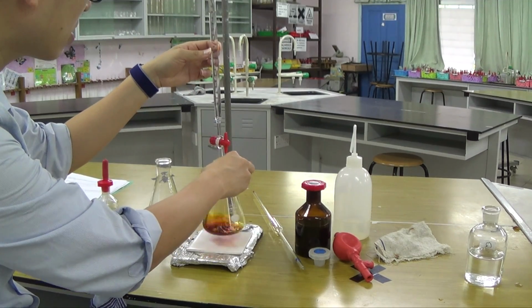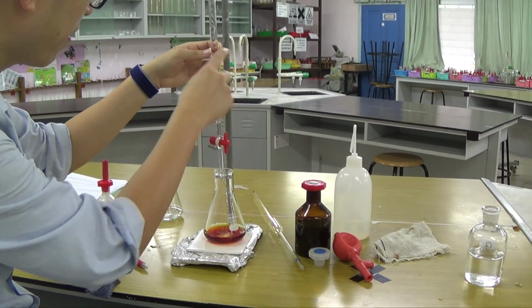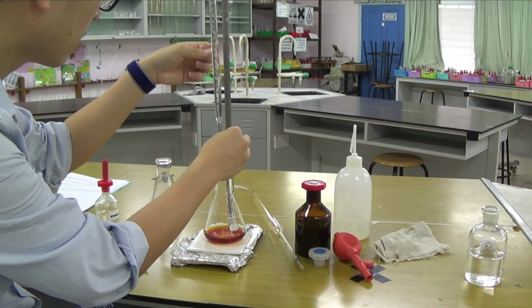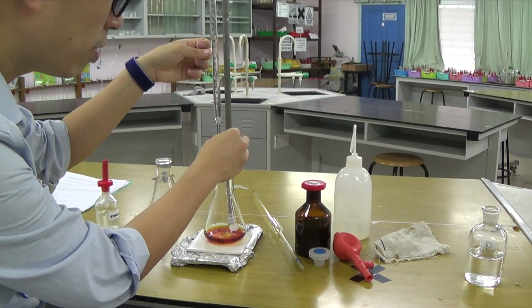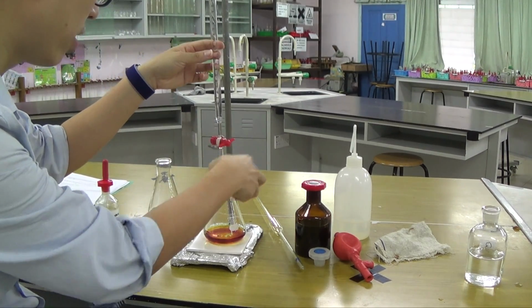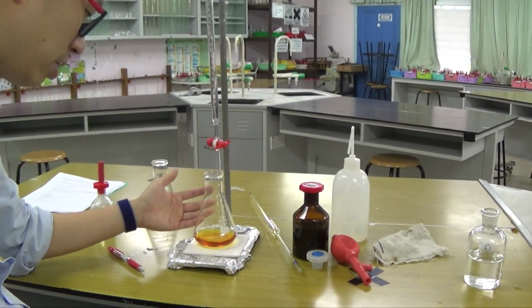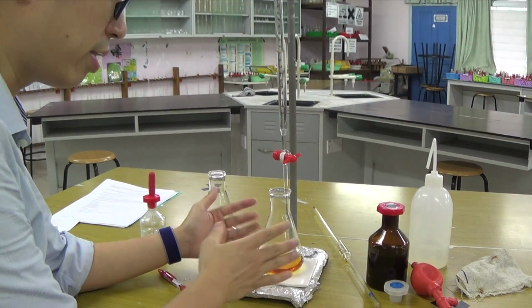Rough titre means in excess. So I'll just keep on adding until it's pretty close to the end point. Then I'll do it drop by drop. That's the purpose. The purpose of doing a rough titration is so that I know roughly where to stop. As you can see, it is still kind of yellow with browns. So there's still iodine left in there.